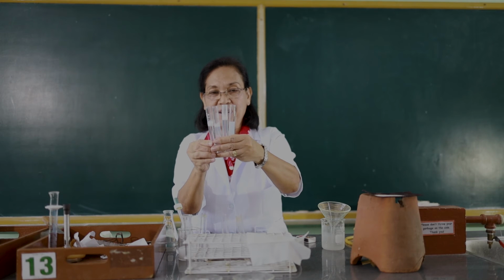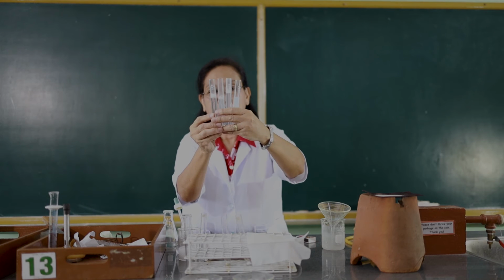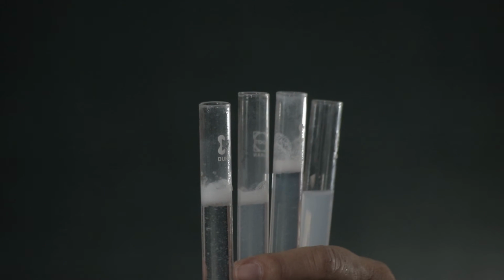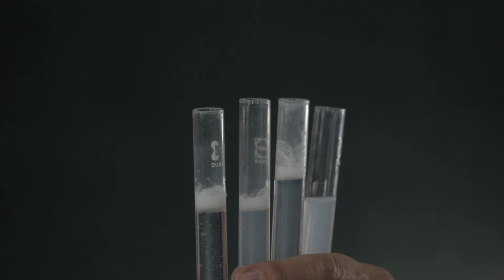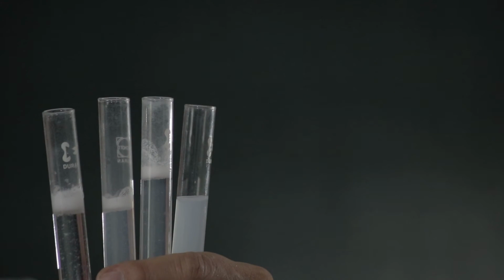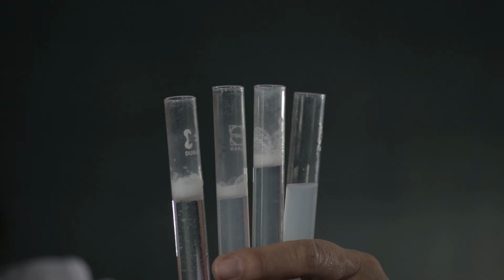If you're going to compare the four, I want you to observe which of them required a lot of soap solution in order to bubble it, or in order to form a good lather.